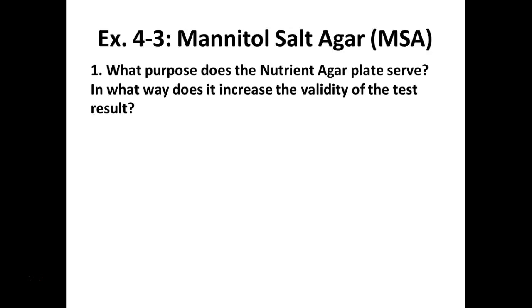All right, so y'all see her plate? It's actually starting to turn a little yellow. We find this kind of happens with Staph epi if it goes too long. It's not Staph aureus, okay? We're good.